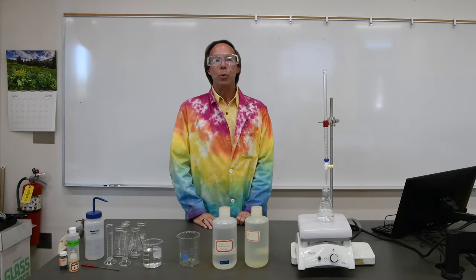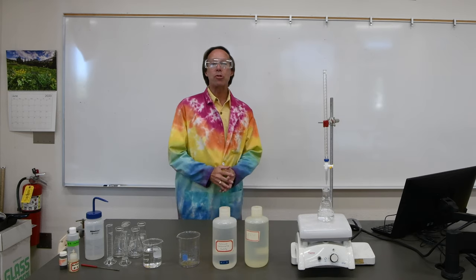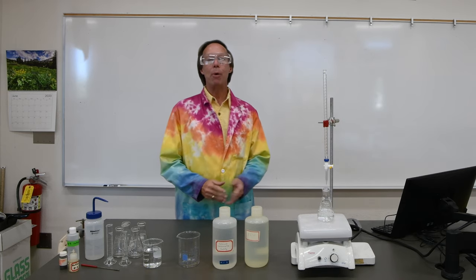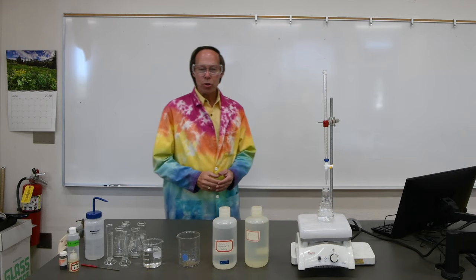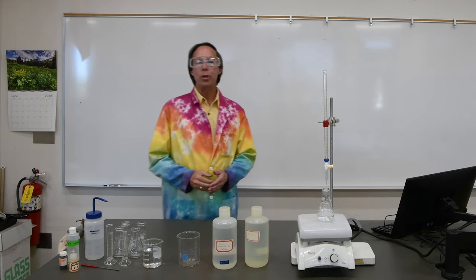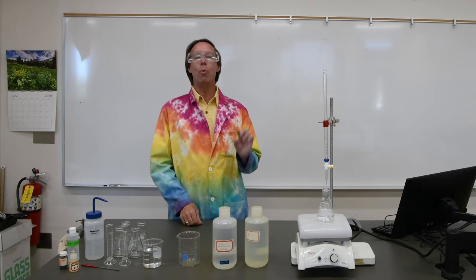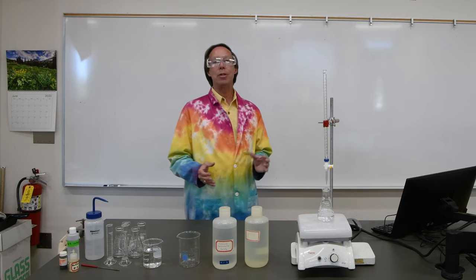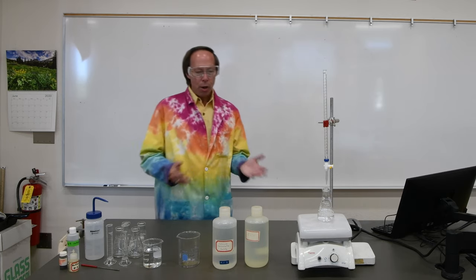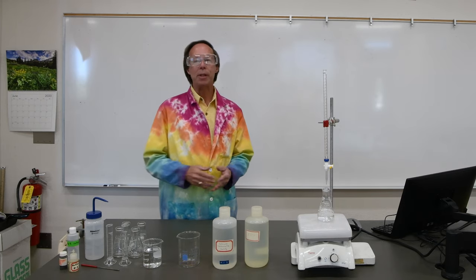Today we're going to be doing an experiment in titration. And a titration is basically a way of determining the amount of a substance in a solution. And a titration is pretty straightforward. What we do is we add a solution that has a known concentration of one substance to a solution that has an unknown concentration of the other substance. I'll cover this in great detail in the following pre-lab video.